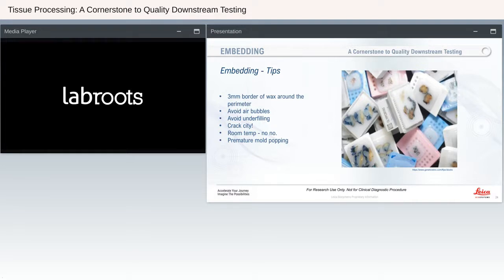Embedding tips. These blocks are great examples of how you want to keep a 3mm border of wax around the perimeter. The only one I can see is at the 9 o'clock position, where it looks like some of that subcutaneous tissue touches the edge of that mold. This gives you the stability and the support you need with the tissue when you're taking those sections.